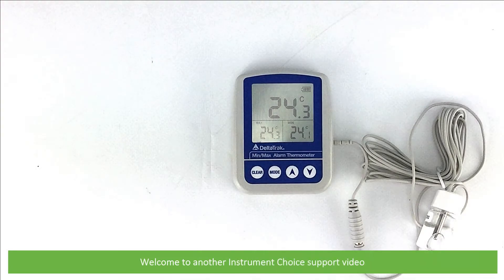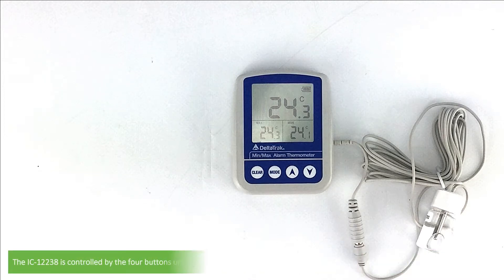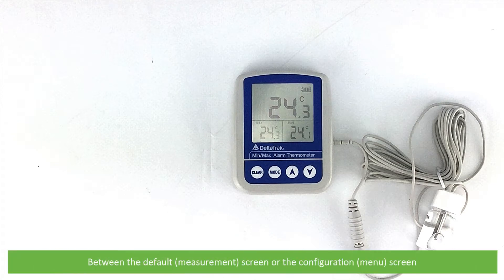Hi and welcome to another Instrument Choice support video. In this video we'll run through the control buttons and how to use the FlashCheck Certified Min-Max Alarm Thermometer, the IC12238. The IC12238 is controlled by the four buttons under the LCD. The functions of the buttons will change depending on which screen you are in, between the default measurement screen and the configuration menu screen.